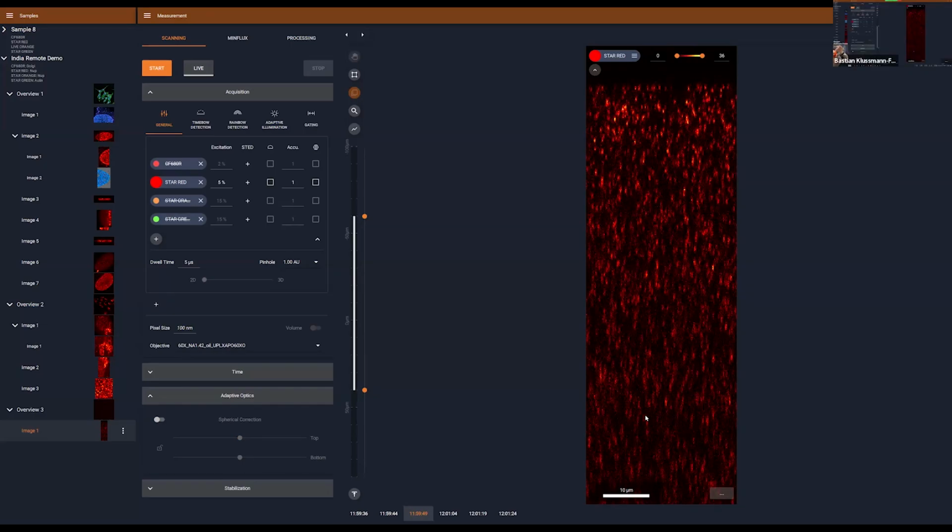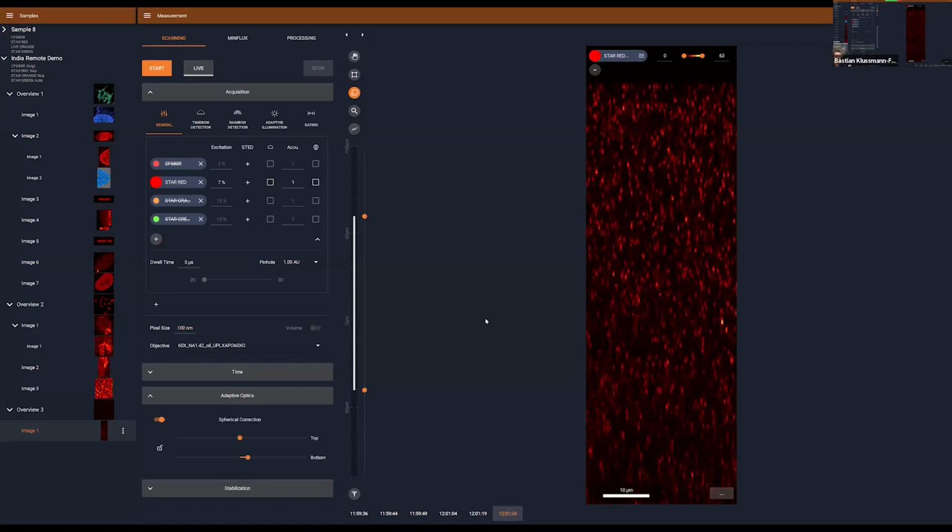So this is the regular STED donut, but in 3D STED we also have light above and below. And if you now consider spherical aberrations smearing that out in the Z dimension, in the middle here there's an empty space, which is basically our intensity minimum. But if you smear that in the Z dimension, then you get your depletion light into your intensity minimum, meaning that you basically lose your STED signal completely. And this is why 3D STED is particularly sensitive to spherical aberrations.